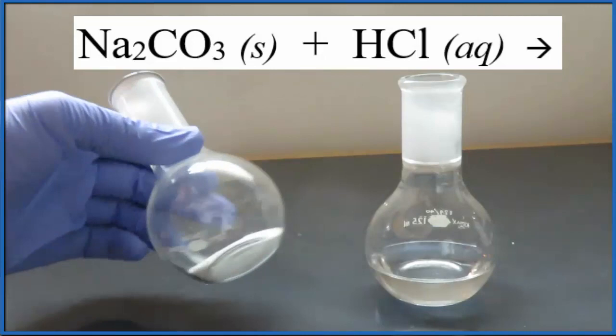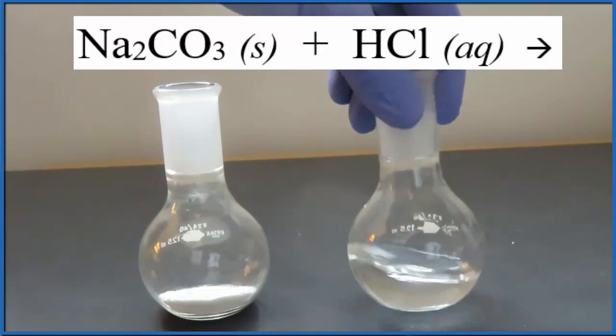Let's take a look at what happens when we put Na2CO3, that's sodium carbonate, the white powder, with HCl. HCl, that's the liquid, and that's a strong acid.